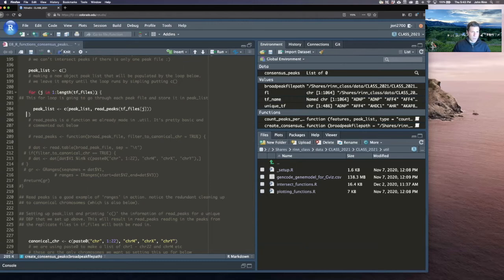So I hope you can start to see how when you build a function, it's really kind of like building a tower of multiple base R functions into an actual function that you're going to use and call. Okay, so now to make that even a little deeper, we're calling functions inside of functions in a nested for loop here.